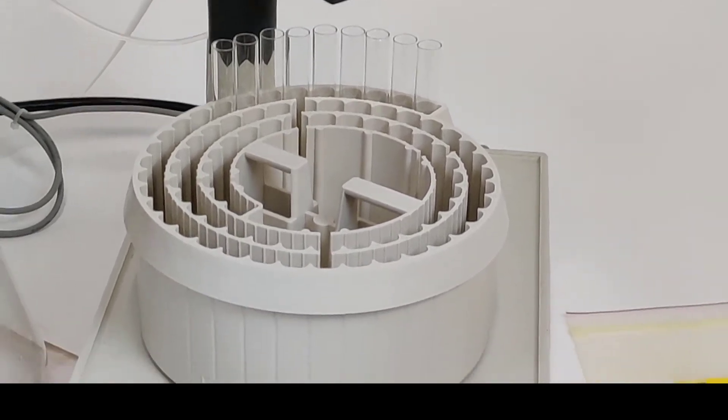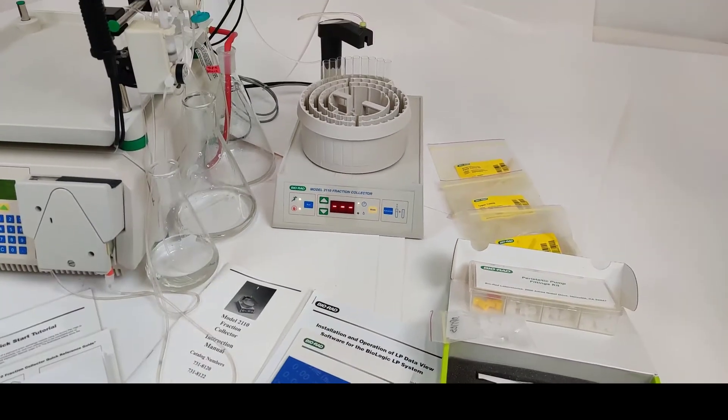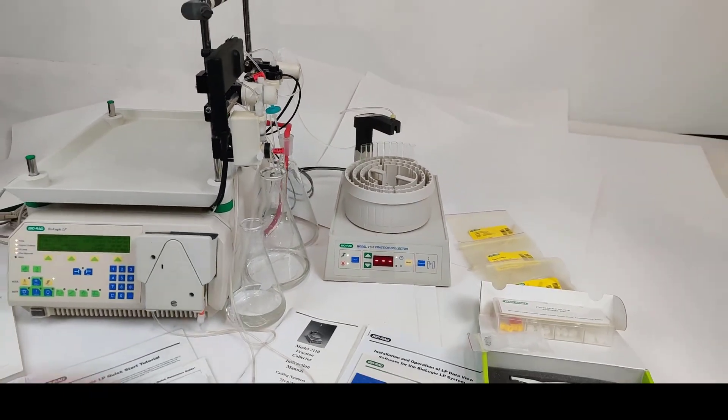There it is — it's dispensing. Beautiful. Thank you very much.